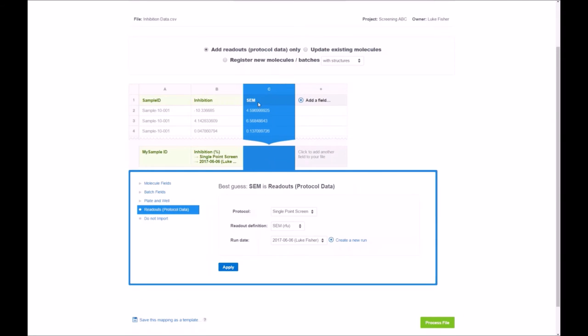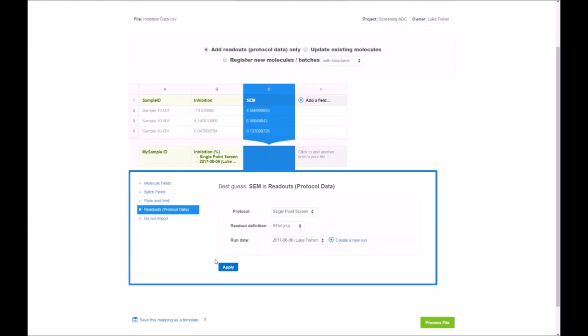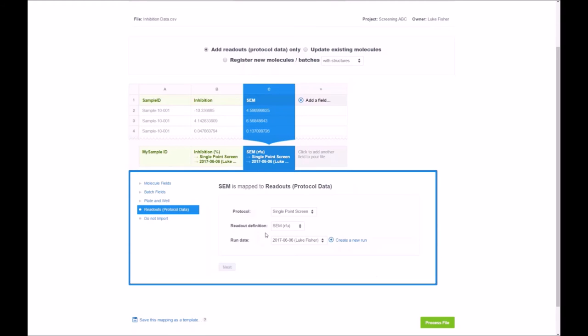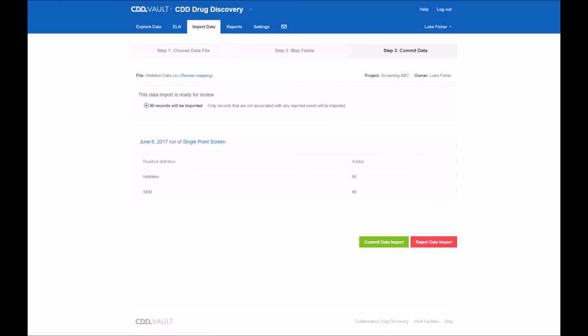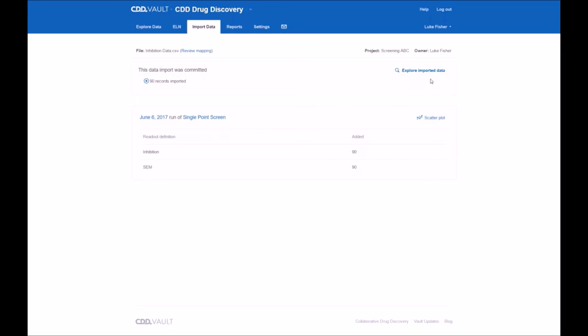In this case, we just use the default. Again, reading in SEM for the same run date and apply and process the file. After the quality assurance step of screen will appear. After it reads everything in, you'll see we have 90 records. All looks as we'd expect. We can commit the data import.